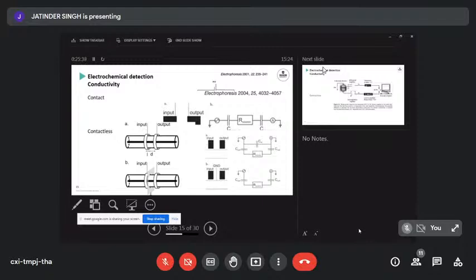And therefore, in capillary-based electrophoresis systems, people have come up with the idea of contactless conductivity detection, where you put rings of electrodes around the capillary, with or without a shield. There's a bit of discussion in the literature about what's good or not. But what happens is that the walls start acting as a capacitor if you apply an AC signal. And through a circuit, in absence of a ground, it looks like this. In presence of the ground, it looks like this.